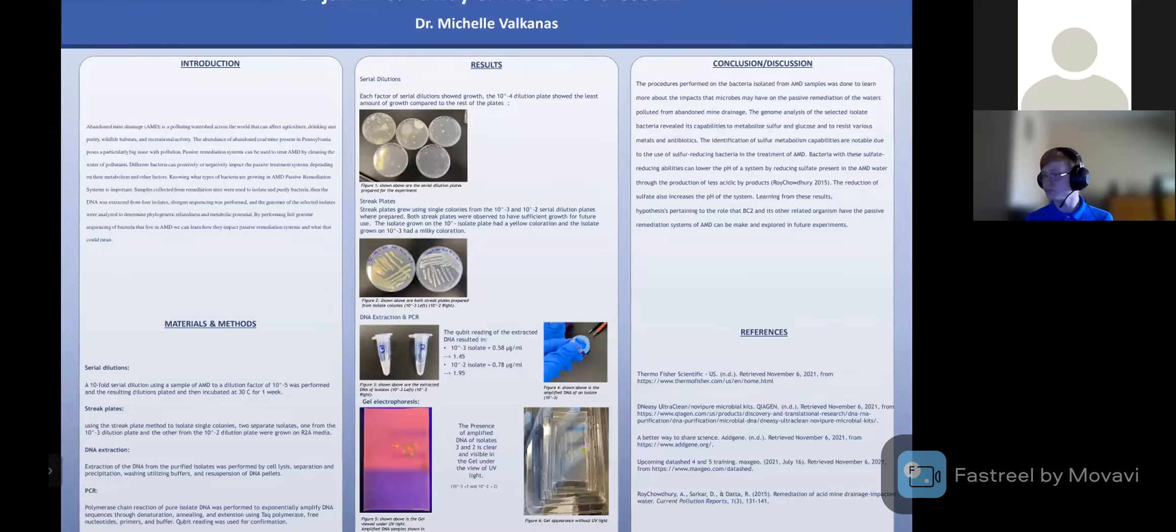Each factor of serial dilutions showed growth. Shown in the image down underneath the text, the 10 to 4 dilution plate showed the least amount of growth compared to the rest. When we moved on to make our streak plates using single colonies from the 10 to 3 and 10 to 2 serial dilution plates, both streak plates were observed to have sufficient growth for future use. The isolate grown on the 10 to negative 2 plate had a yellow coloration and the isolate grown on the 10 to negative 3 plate had a milky coloration, as shown in the image.